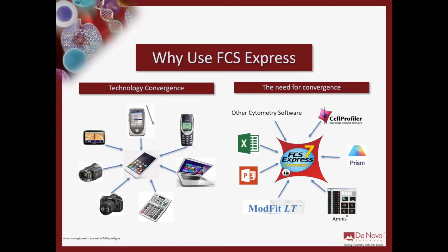The same thing can be said for flow cytometry data analysis. Essentially, if people are using other cytometry software packages, they're having to take that data and copy and paste and go out to Excel. If they need to get it ready for a presentation, they need to copy and paste and move things out to PowerPoint. And I know a lot of us have been guilty of wasting time putting little white text boxes over axis labels in PowerPoint. And even if you need to go out and use tools like Prism for advanced statistical analysis, all of this is wrapped up now in FCS Express.